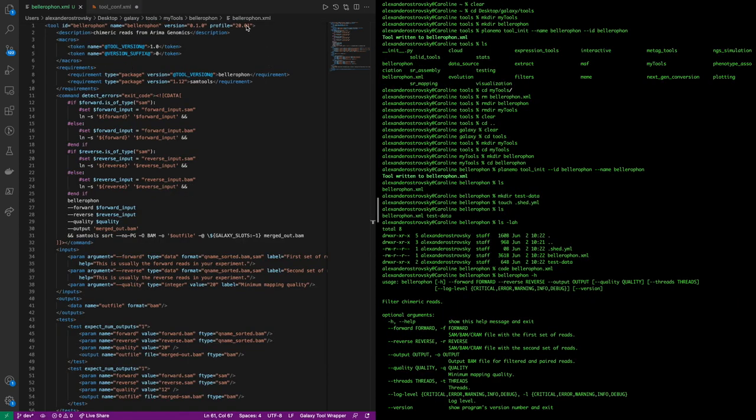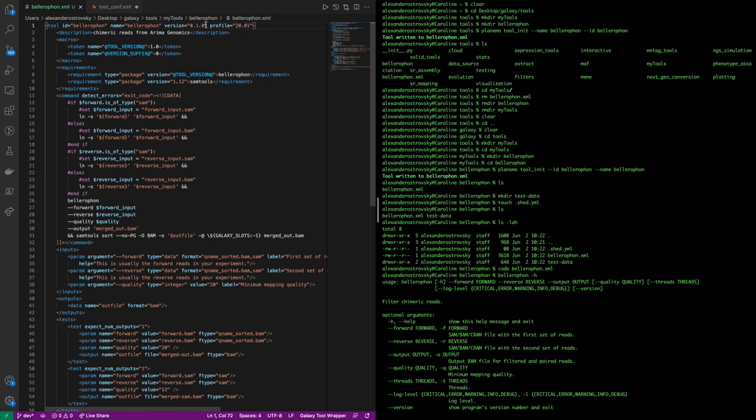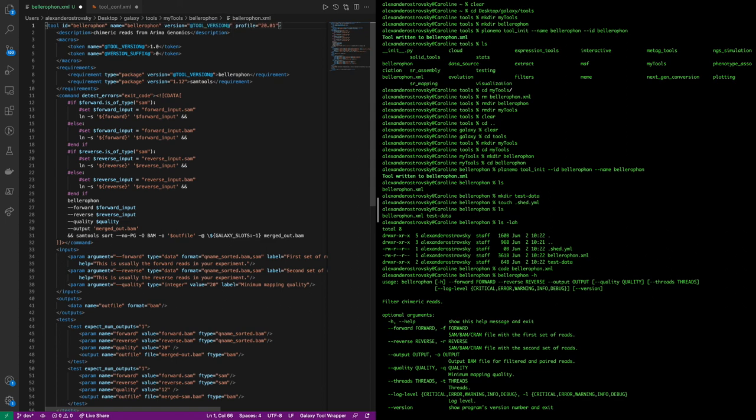Lastly, we also ensure that we use the proper formatting for wrapper versioning in this wrapper. For this, we are going to be using the tool version and version suffix that we set in the macros. And the final format should read as the tool version plus galaxy and then the galaxy version, which is the version suffix. So, the string should look like this.